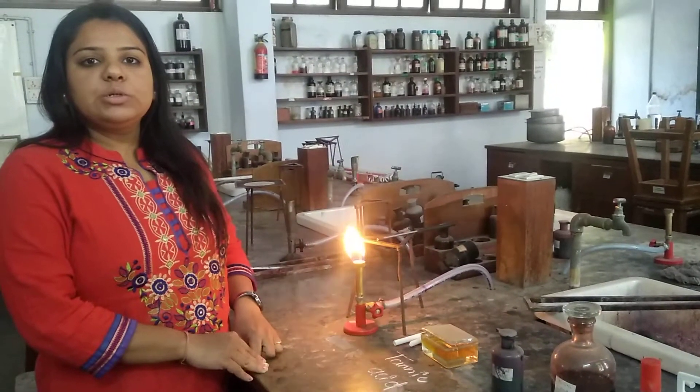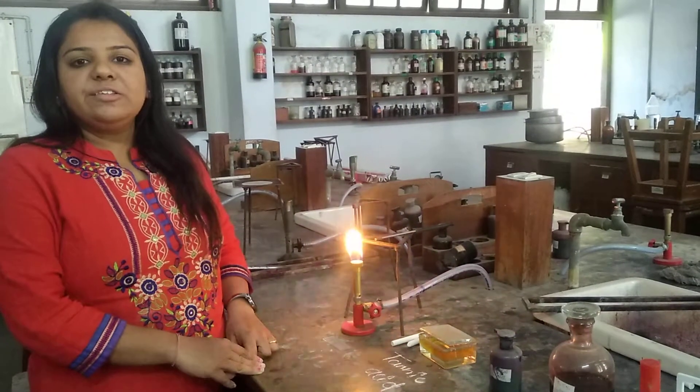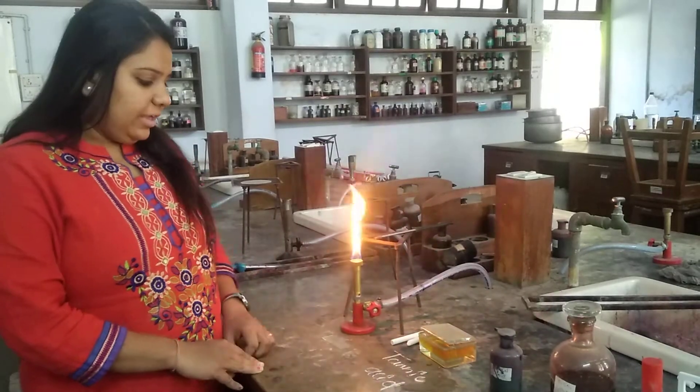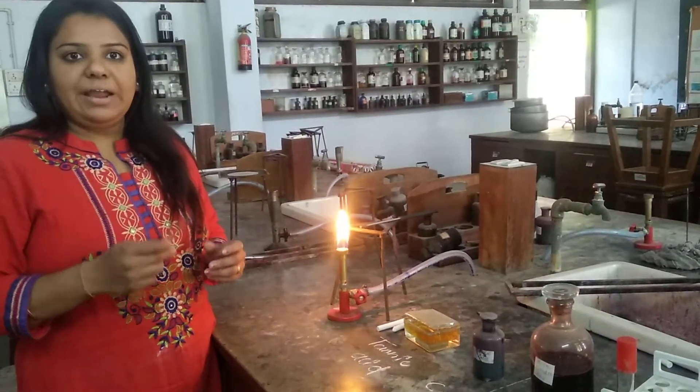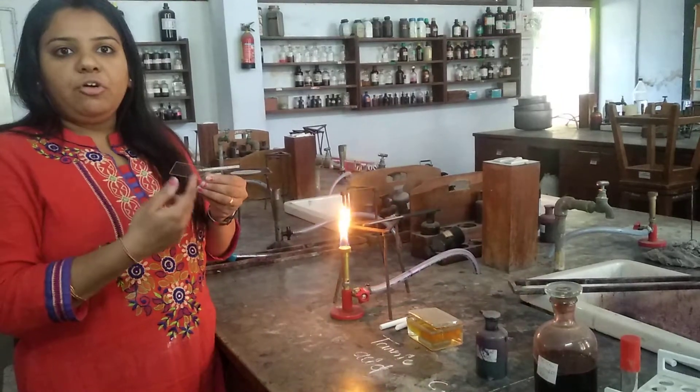Welcome again, dear students. Let us continue understanding about the cell wall staining. First of all, we have to take a clean glass slide and we have to mark for the smear.